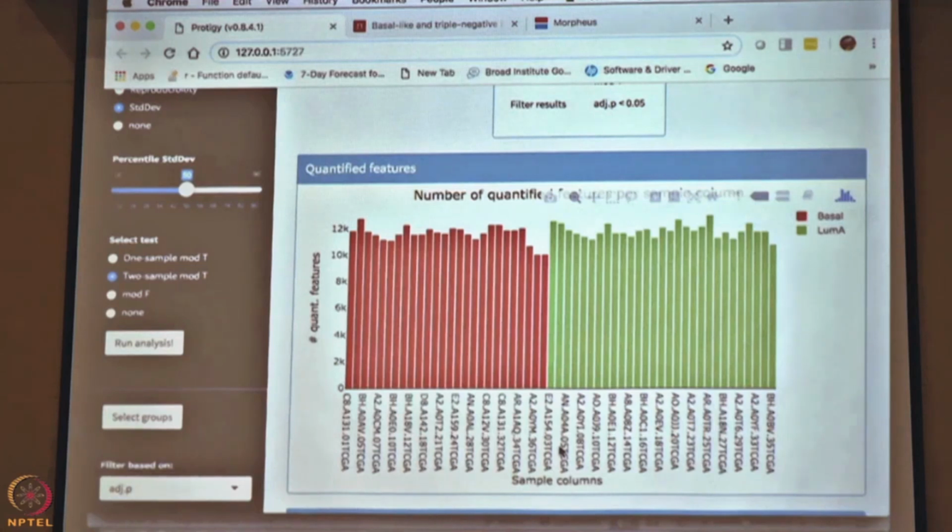Maybe you have changed your p-values or you used a different normalization. No, maybe I have the basal versus HER2. Maybe if you see the last one, the number of significant. I think they have used a different kind of. Yeah, you could have used a different test or different groups. Mine is basal versus HER2, so it's a different thing. Yeah, obviously. Yeah.